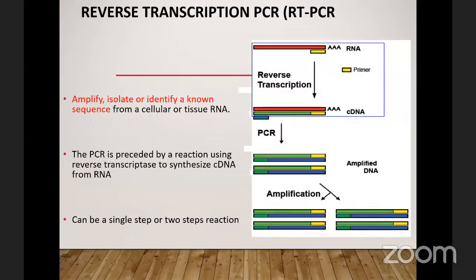So reverse transcription polymerase chain reaction is what we do when we want to work with RNA instead of DNA.